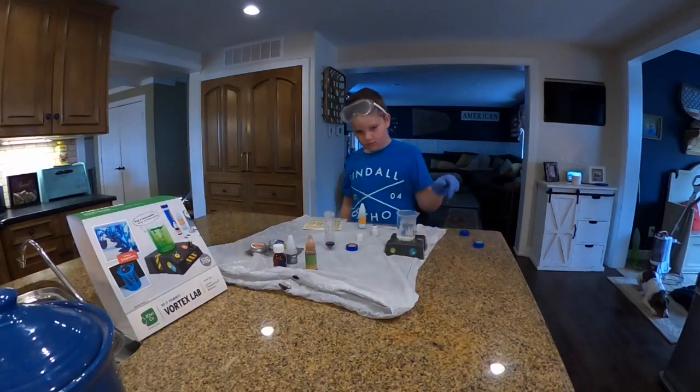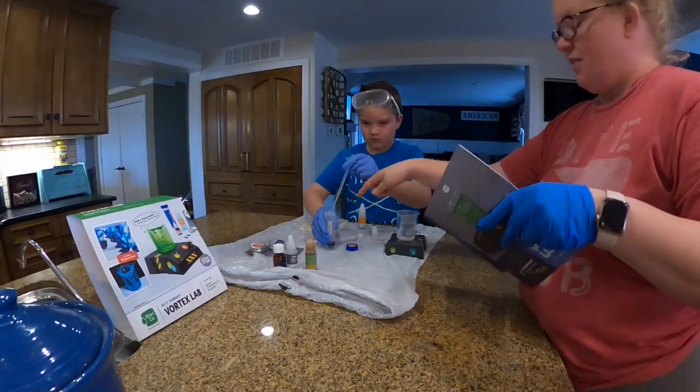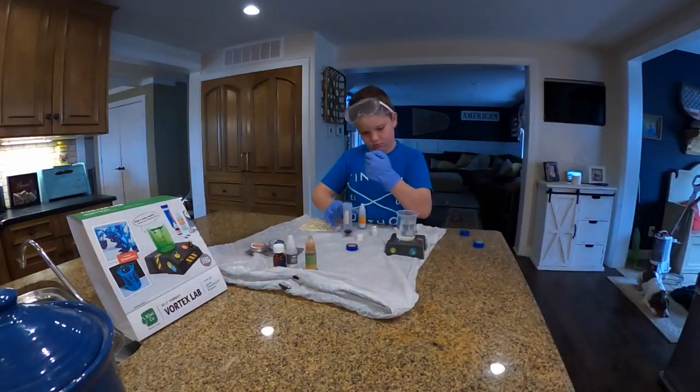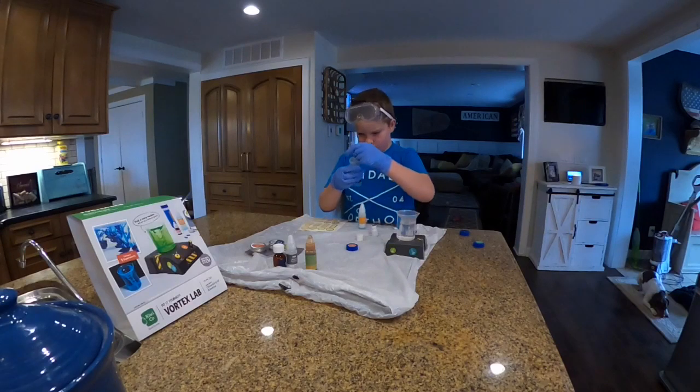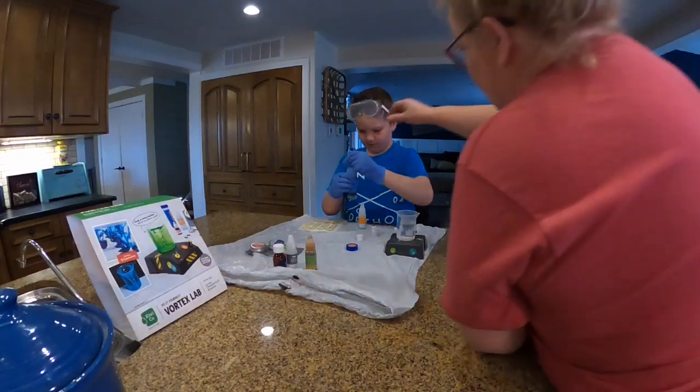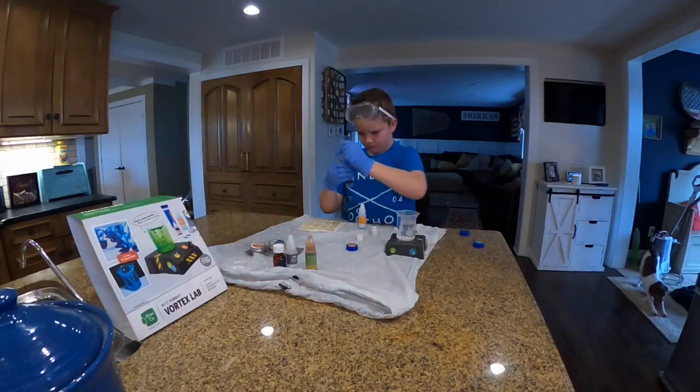Now it says use your clean pipette to take a half milliliter. Find a half on there — it's not going to be very far up. It's the first line here. And then it says squirt it into the beaker. You're losing some there — you want me to help you with this part? When you get it to the half, hold it there, then quick move it over and put it in the beaker.